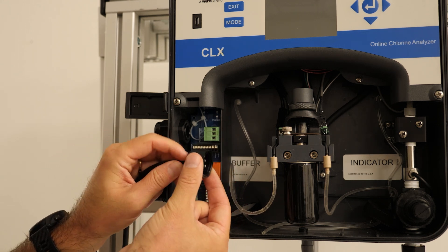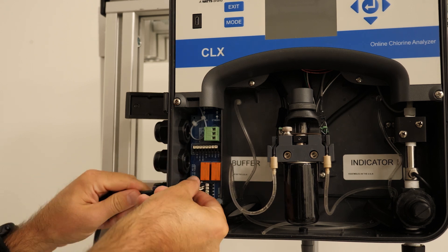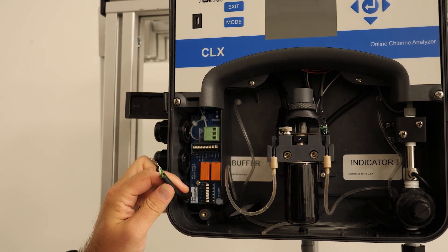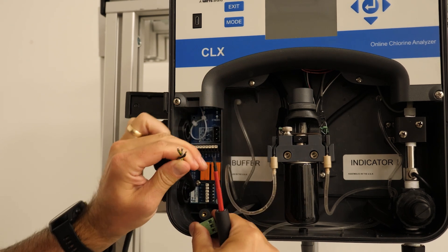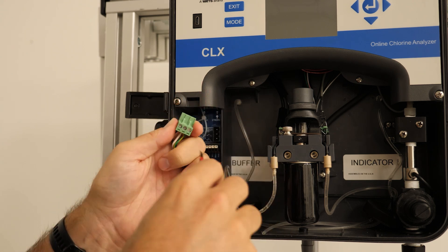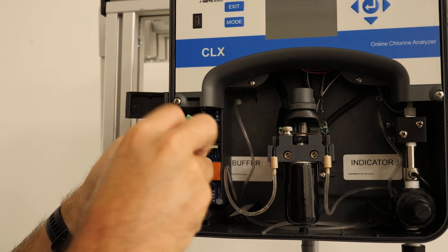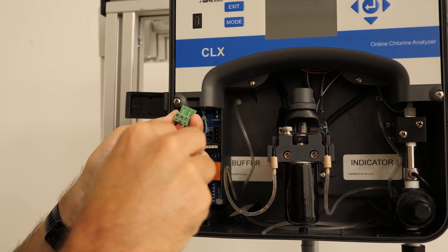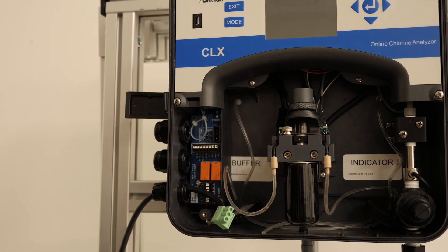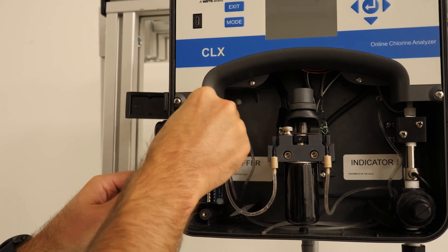Next, we push our wiring through the cord grips. Make sure to wire the green wire to ground, white to neutral, and black to live. Push the green fitting back into place and tighten the cord grip to make sure our wire won't get pulled.